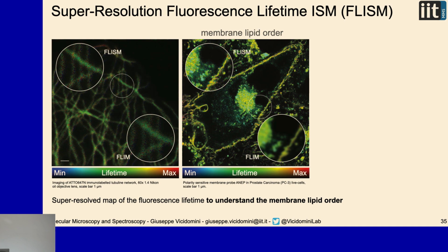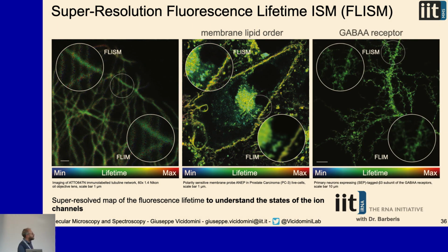Together with super resolution, because as I showed you before, by using the spatial information you can gain in resolution. That's another example, where we try to understand, using the lifetime, the state of an ion channel, when it's open and when it's closed. So it's again a sort of functional information. Everything is live, obviously.